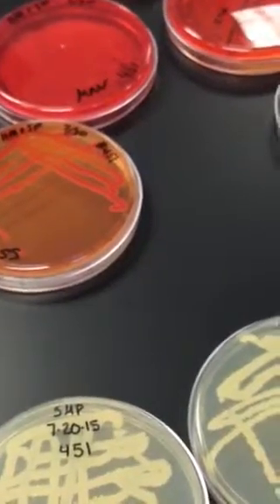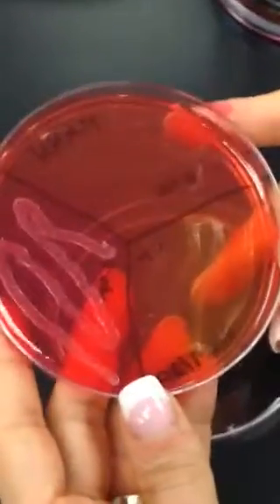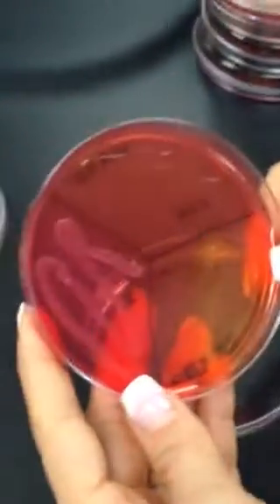The last agar is your mannitol salt agar. This one selects for gram-positive Staphylococcus. It's the salt. Remember that. It'll be on your test. Staphylococcus likes salt. Not an extreme salt lover, just mild salt, like on your skin.